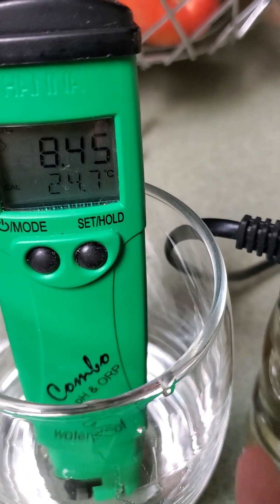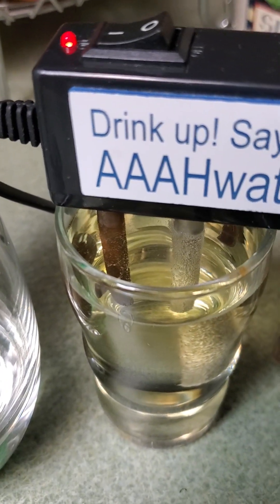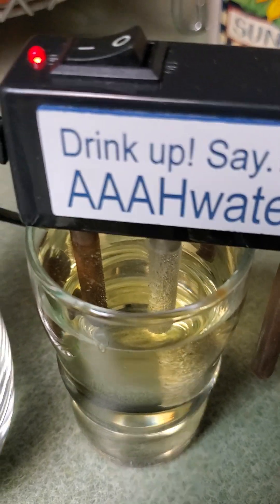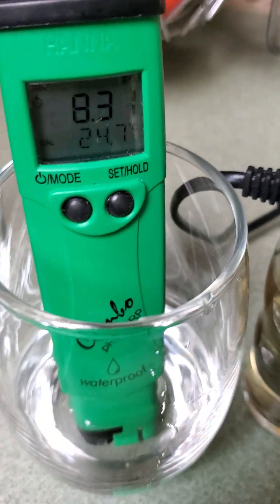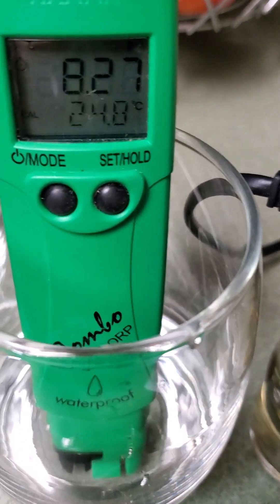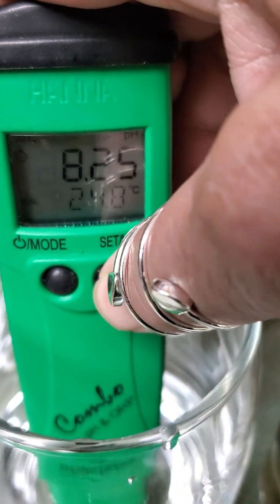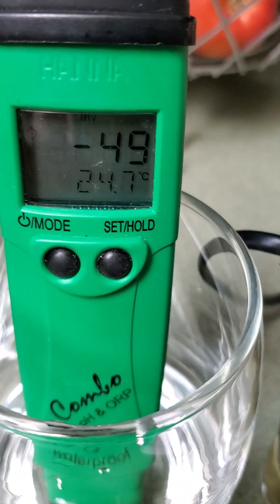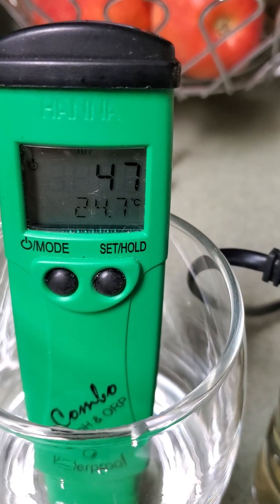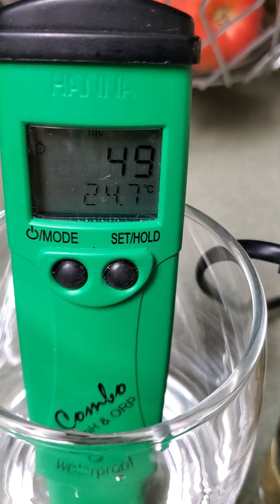We're going to let this continue — as reverse osmosis water, we don't expect a whole lot of metals, but you can see some yellow iron appearing. Let's see how it does after a few more minutes. Checking the antioxidants — it's a positive number, 47, going up a little... 49. Looks like it'll sit around positive 50.